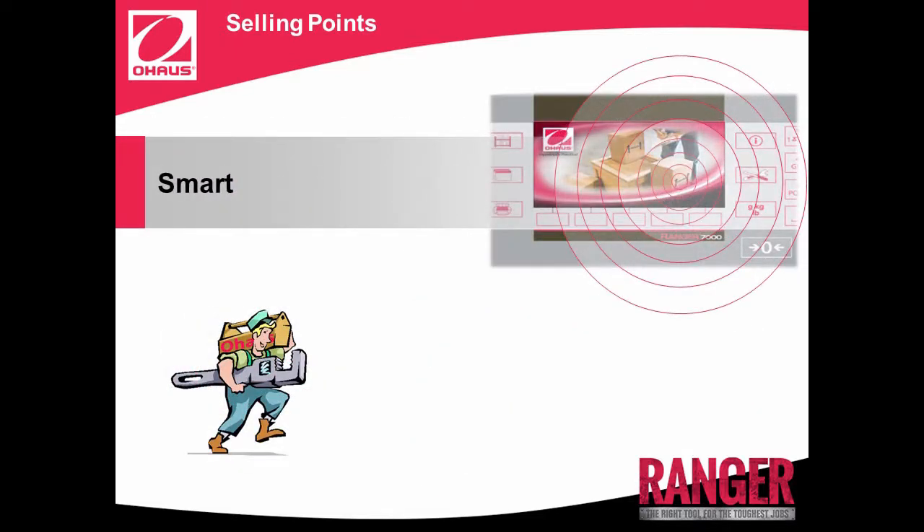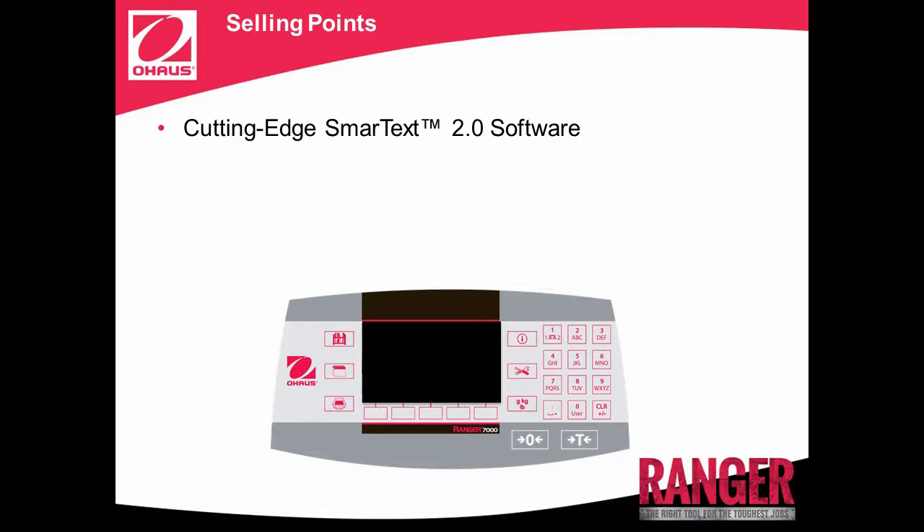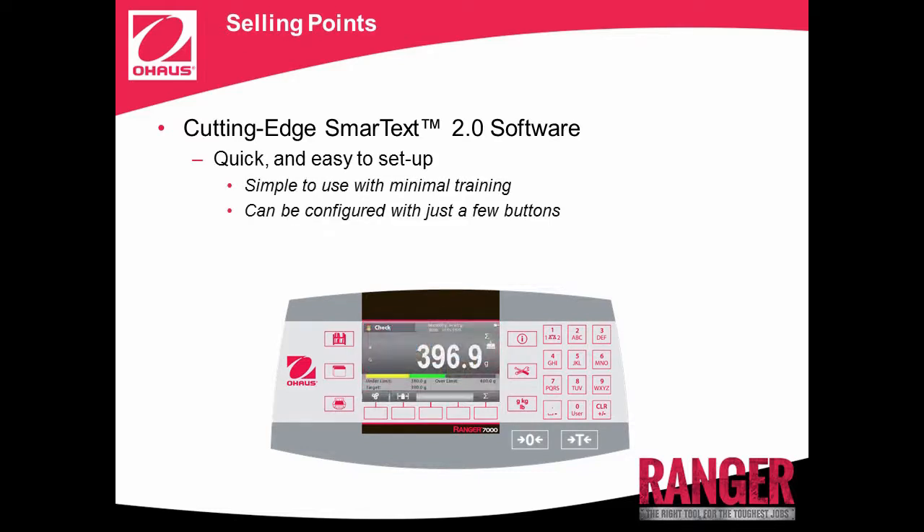Smart, with OHO's cutting-edge SmartTex 2.0 software and technologically advanced features. Tired of antiquated industrial scales? The SmartTex 2.0 interface will have you easily using the Ranger 7000 for all of its unique and advanced features quickly. SmartTex 2.0 makes an advanced scale very simple to use, and will greatly reduce training time for operators. It's also simple to set up, and can be configured with just a few button presses.